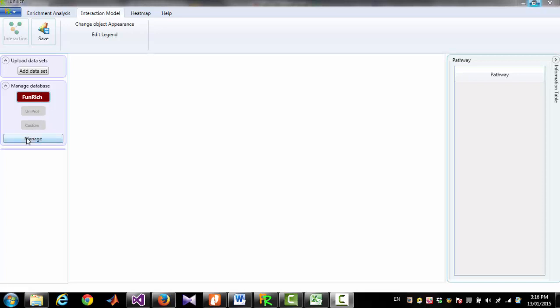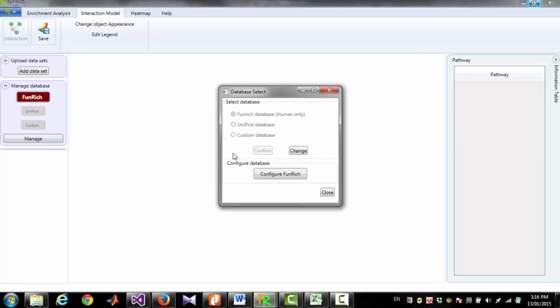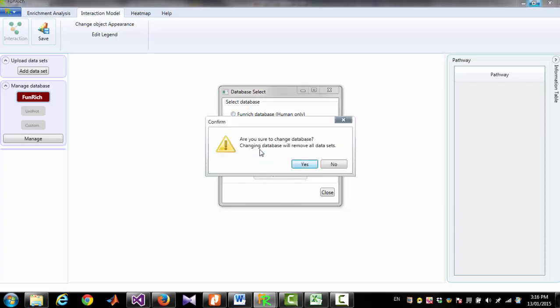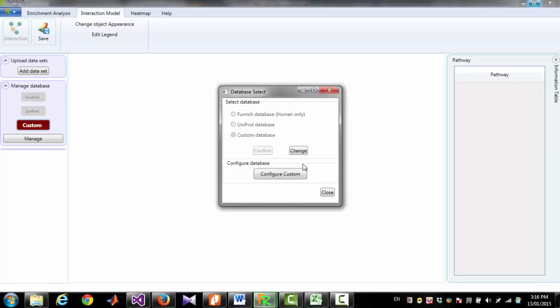To do that, you have to click 'Manage,' then click 'Change,' then click 'Custom Database,' and then click 'Confirm.' This will remove all the existing datasets. I have clicked yes. Now custom database is selected.